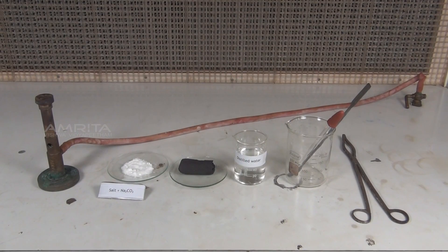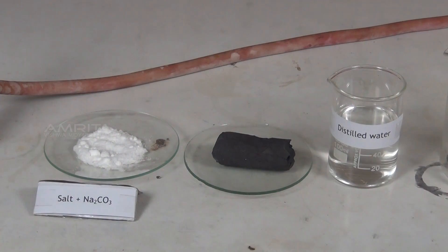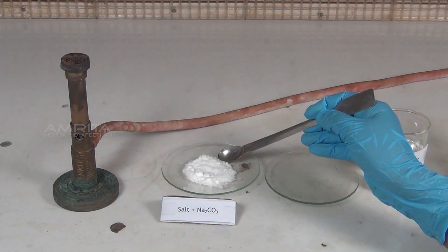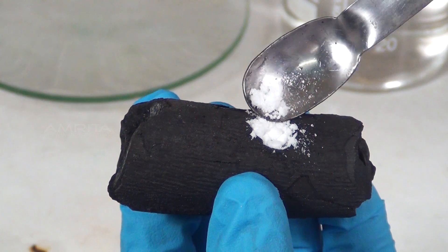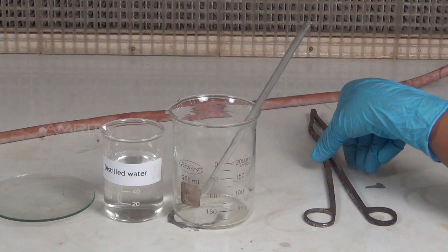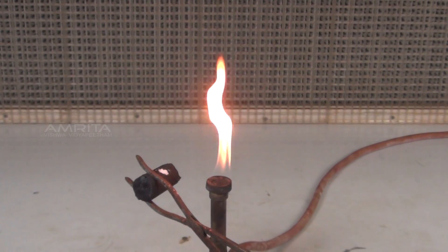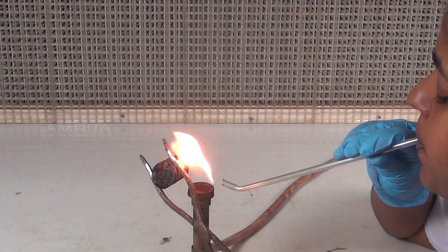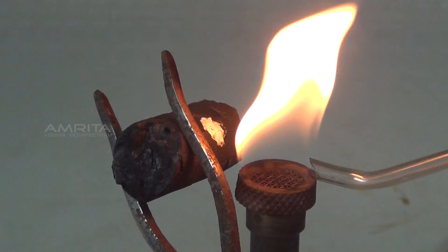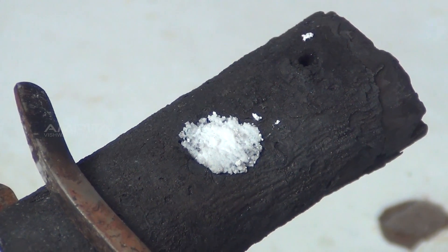Procedure: Take a mixture of a small quantity of salt and double its quantity of sodium carbonate in a watch glass. Take a charcoal piece with a small cavity in it. Using a spatula, place a small quantity of the mixture in the cavity of the charcoal piece. Using a dropper, add a few drops of distilled water to the mixture to moisten it. Using the tongs, hold the charcoal piece in front of the reducing flame of the Bunsen burner. Direct the reducing flame on the cavity by means of the blow pipe and heat strongly for some time. A yellow residue is obtained on heating and it becomes white on cooling, indicating the presence of zinc ion.